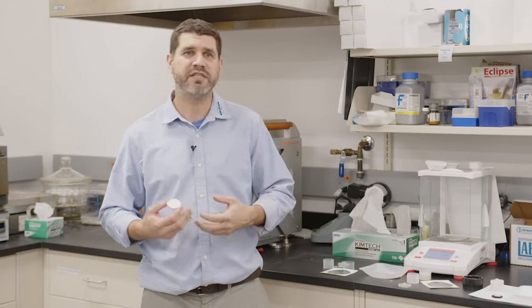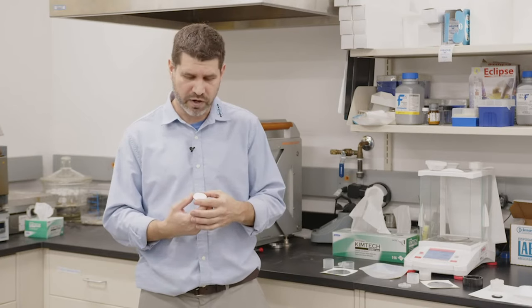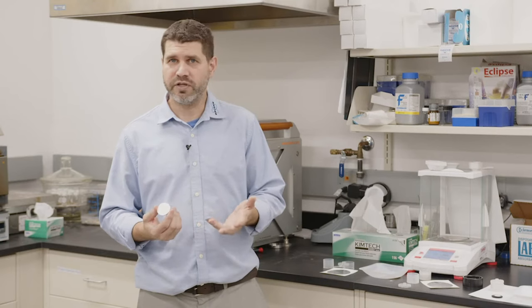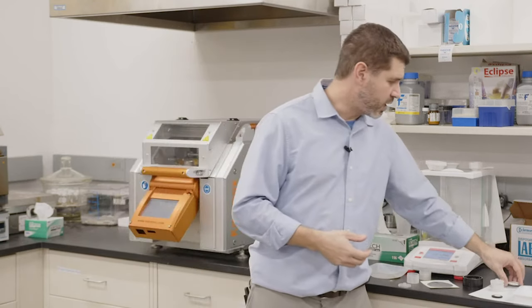Usually we grind about 15 grams of sample with 1 gram of binder, but it's different for different types of samples that are out there. And then we usually press it for about 30 seconds at 30 tons, and then we have a pressed pellet.